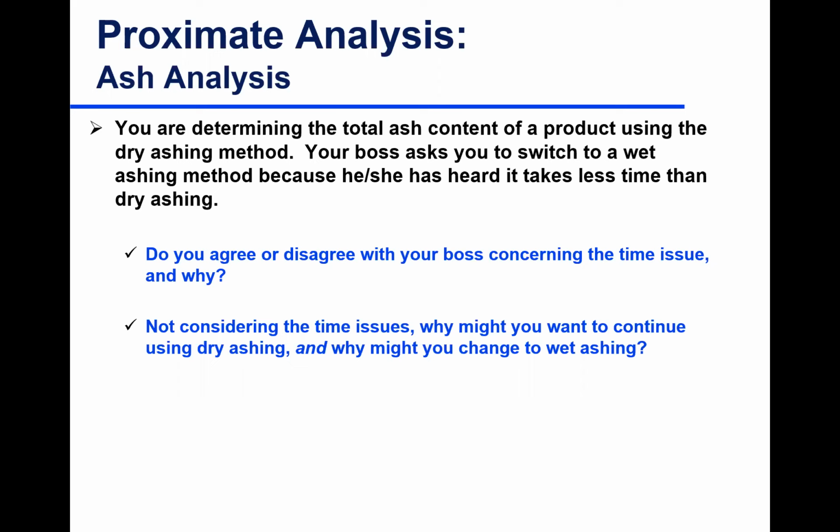Disagree: needs special hood and training. That's one perspective. Okay, especially if you want to use perchloric acid, yes, it's more involved and you need training and safety. Okay, that's one answer. What else?